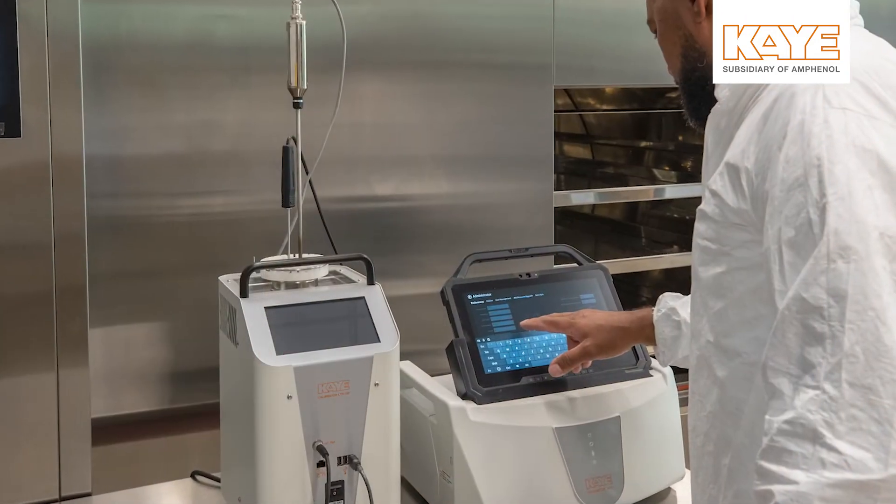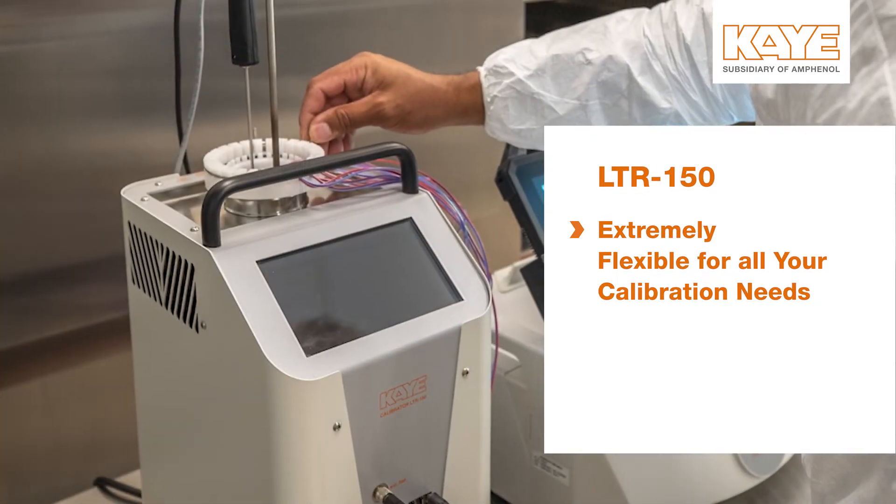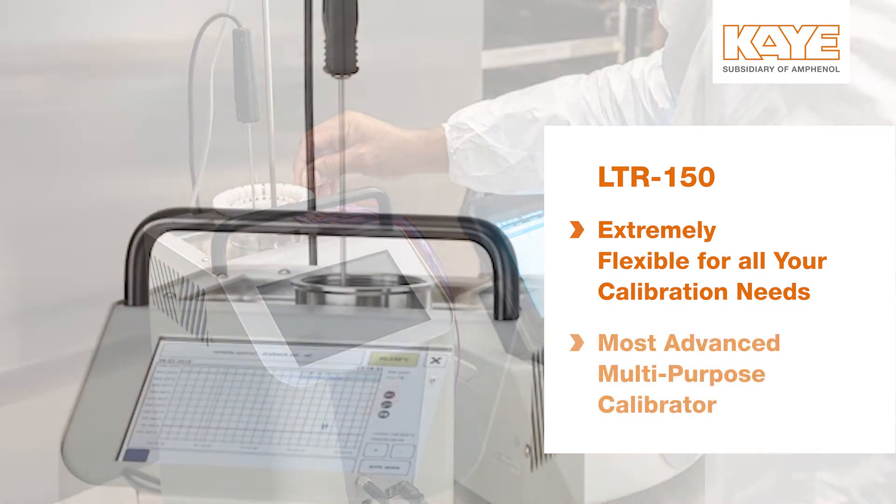The LTR-150 is backwards compatible with all K validation systems, including the Validator 2000, Valprobes, and RF Valprobes.